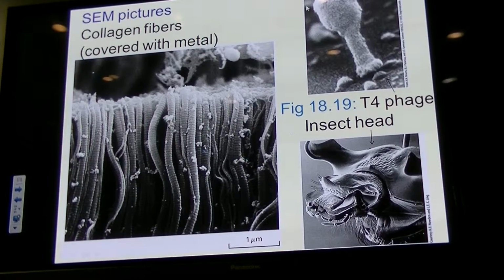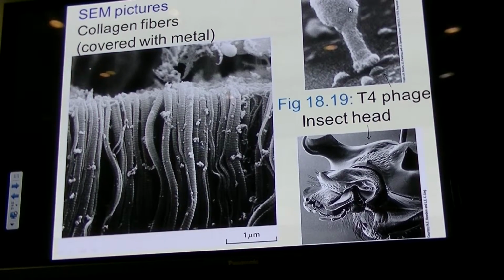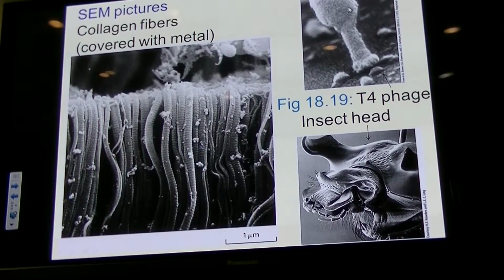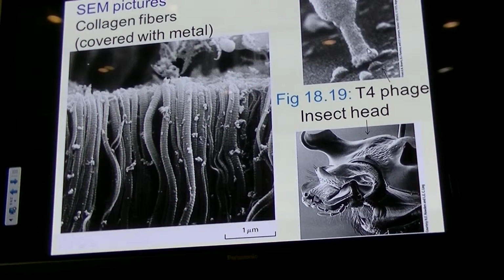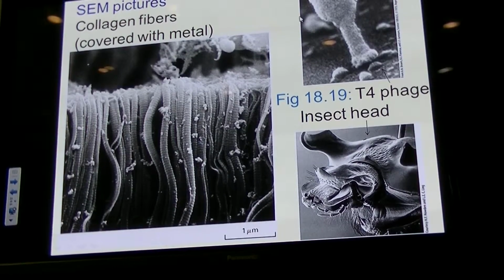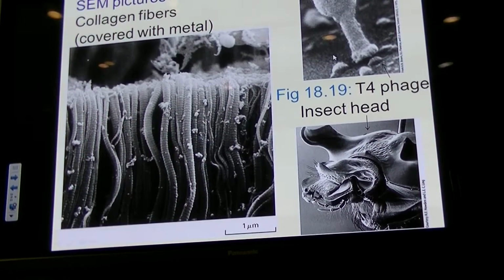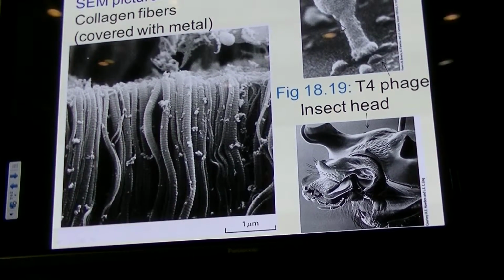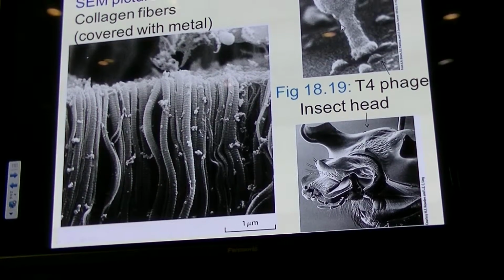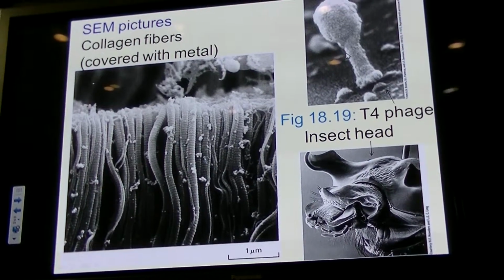So here we have our friend, the bacteriophage T4, one of the T-even phages, as we call it. This is a virus that infects bacteria. So here we have a very high resolution image. This little viral particle was covered with heavy metals in order to make it visible. So where is the detector? What would you say? I think it is top left for you.